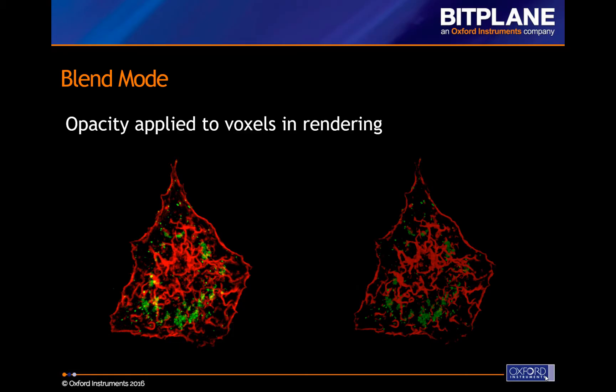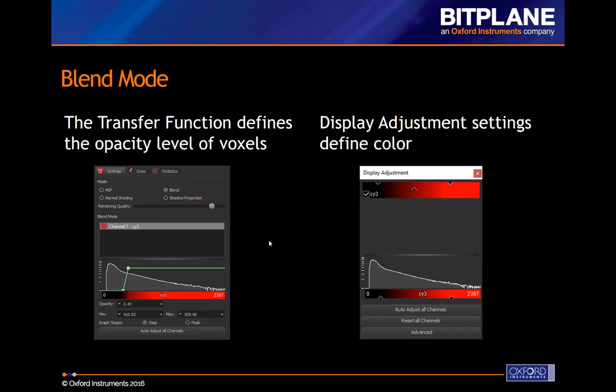Within Amaris, the MIP volume rendering mode is used most often. We encourage users to also render with the Blend Mode because it adds opacity to the voxel rendering. Here, you cannot determine if the green granules are above or below the red actin on the left in MIP mode, but you can on the right using the Blend Mode.